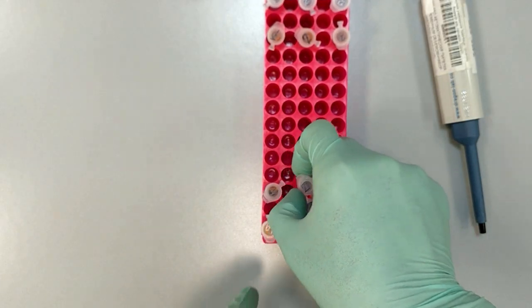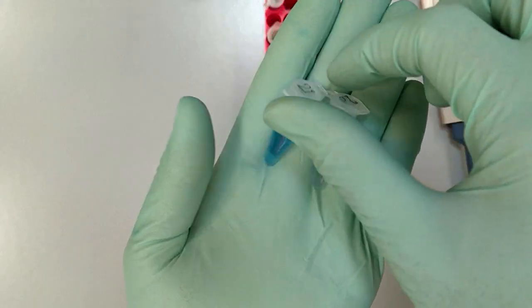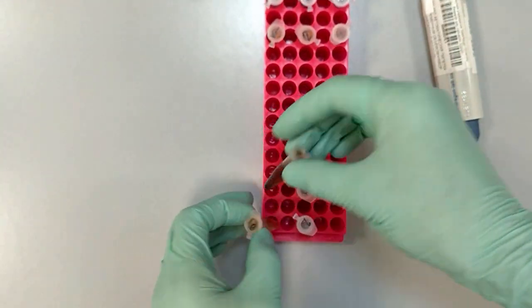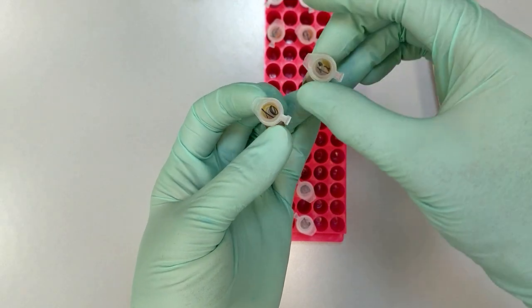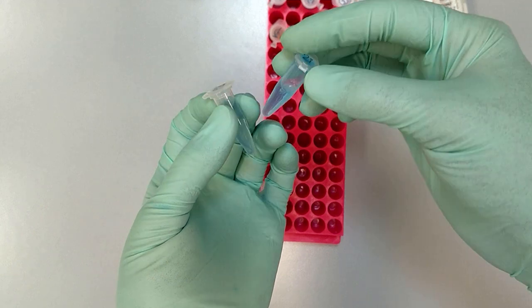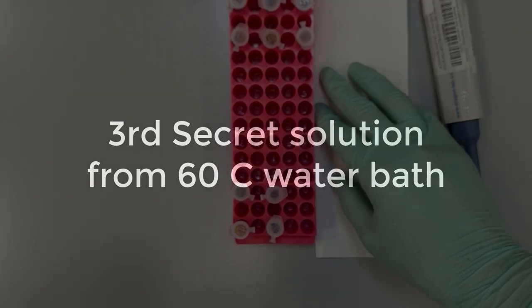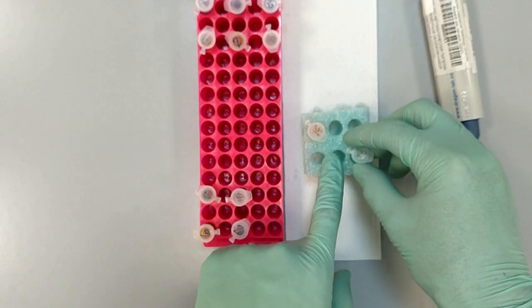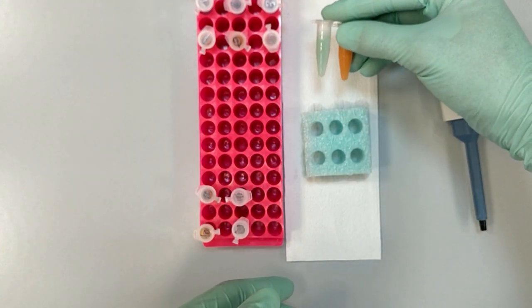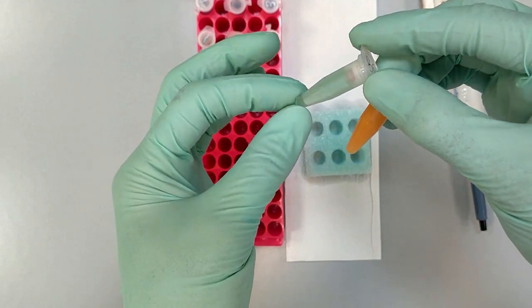Okay, so we had 10 minutes passed and here you can see that the reaction actually happened in the inside tube. In the outside, we don't see much difference. Okay, so again, in the first one, when we added the iodine, again the inside reacted and the outside didn't. The same way happened in the second secret solution. Now we also removed the sample of the third secret solution from the water bath. And here you can see again, the insides really worked. I mean, the reaction happened, while the outsides, nothing has changed.